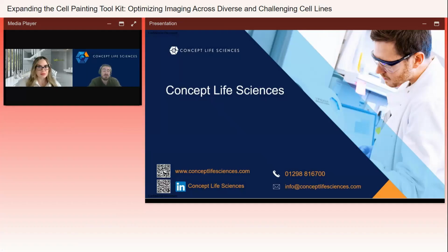So the ones that we selected was kind of a happy coincidence. It was ones we had access to and ones that were displaying different phenotypes. There wasn't a hard and fast criteria, and to be honest with you, I don't actually think there is a complete cell line panel that you could design. It's always going to be dependent on the question that's being asked. The main thing is if you can cover as broad a panel as possible to get the most out of the data that you can, that's going to give you the best chance to succeed.